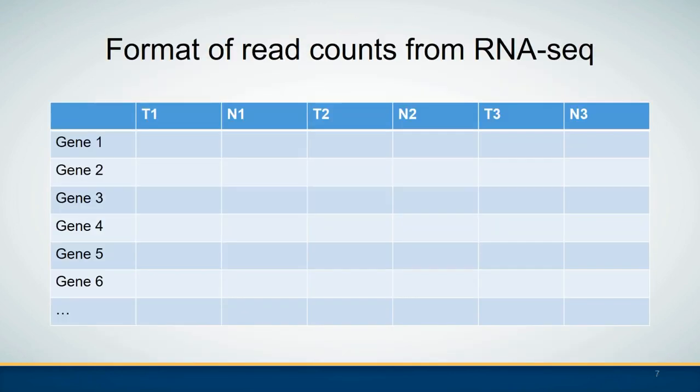Here is an example of expression data for RNA-seq, which is also called the read count data. In this matrix, the rows represent different genes and columns represent samples. In this example there are three tumor samples and three normal samples.